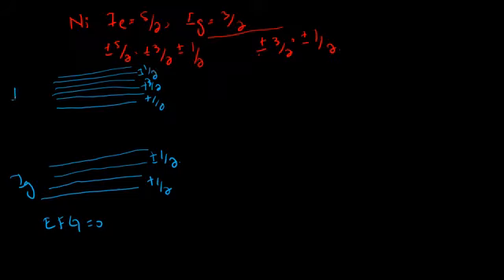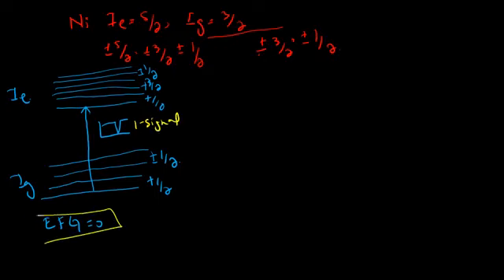So when the electric field gradient is equal to 0, there is only one transition, and the corresponding Mossbauer spectrum for this case will be like this one. That is, here we observe only one signal, and quadrupole splitting is absent.